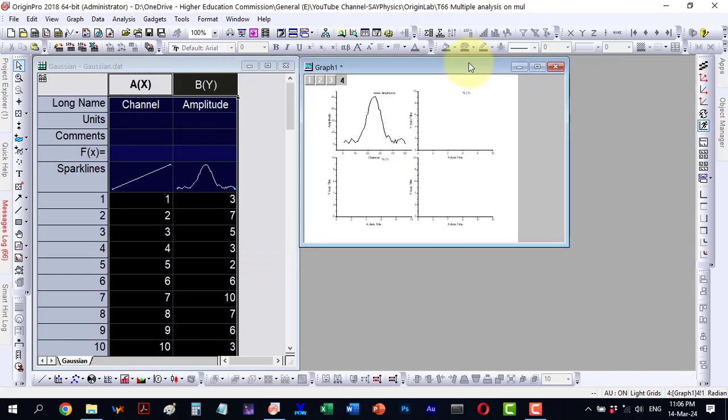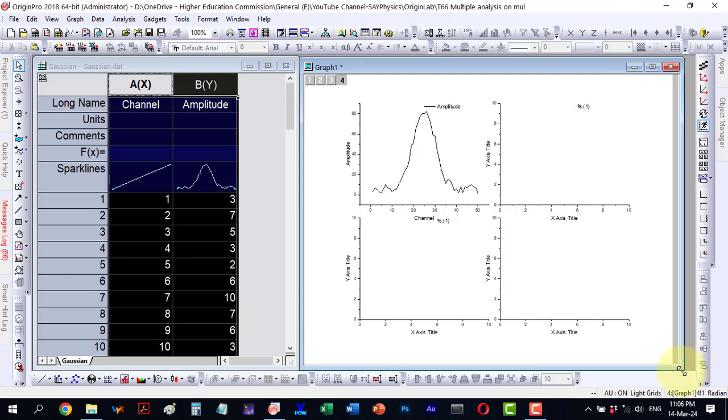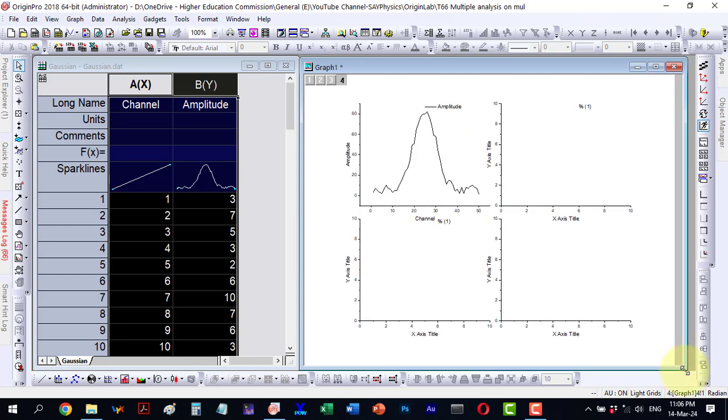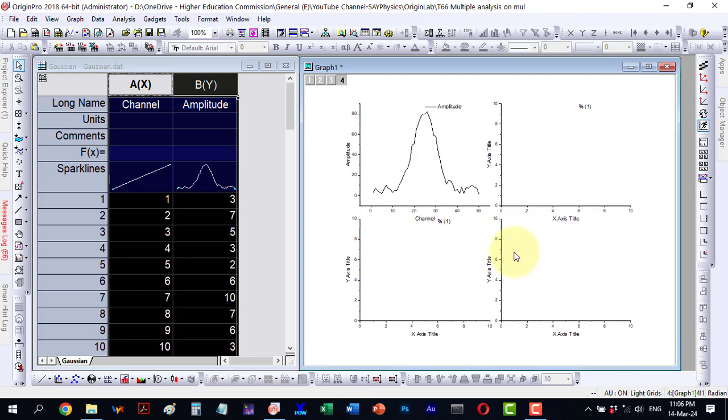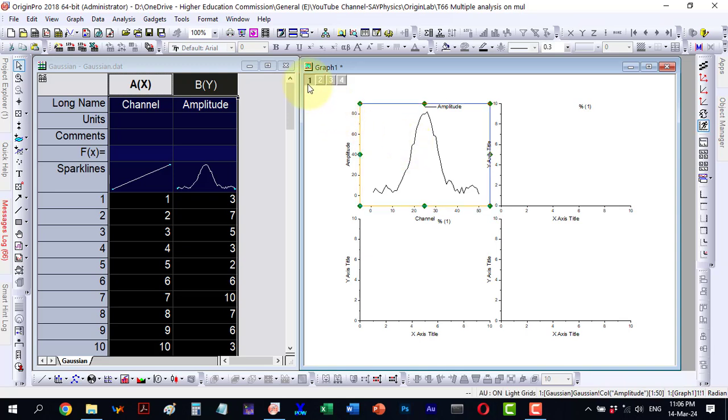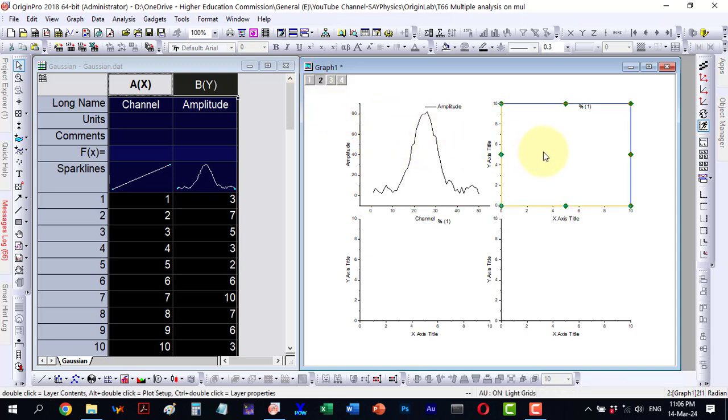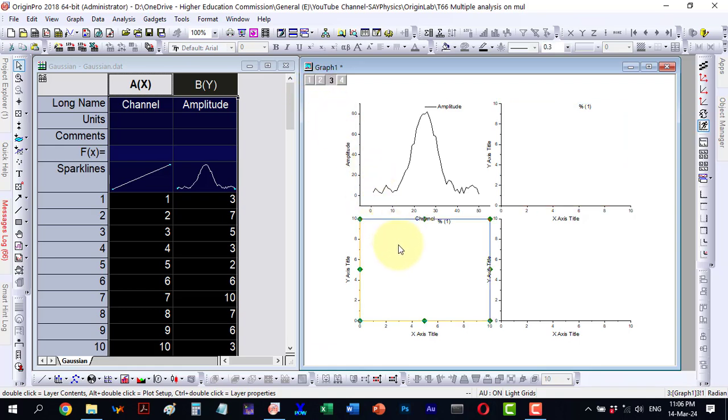We can see it has a four panel layout with four layers plotted. Upon inspection we observe layer 1, layer 2, layer 3 and layer 4.